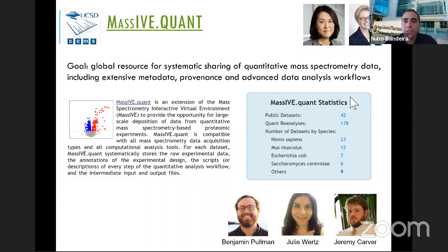So it really streamlines this process. I believe today we're already going to start with cases where the TMT data had been extracted previously, but we now have ways to do that directly in the system, and we should be able to show that soon. But it's definitely possible to do this both for ID and for the quant analysis.